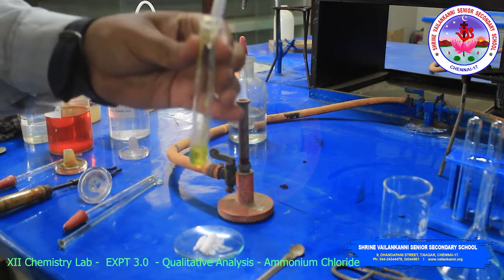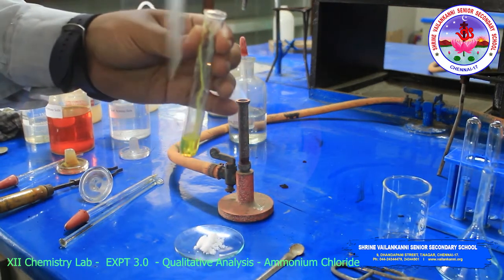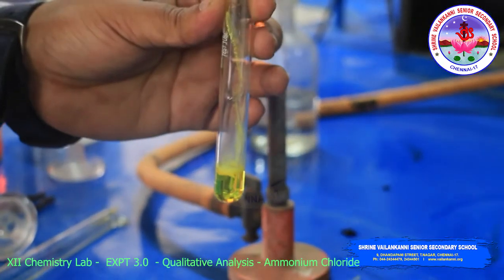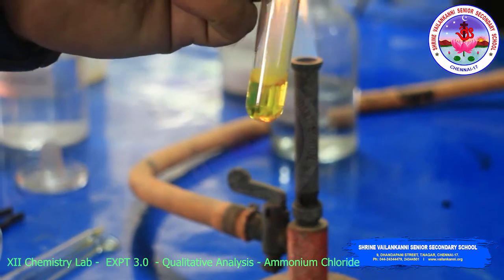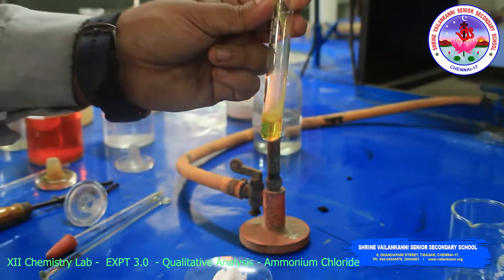Now the lead acetate solution is added. Look at this yellow precipitate. The yellow precipitate is formed. Can you see the yellow precipitate? So this shows chloride is confirmed.